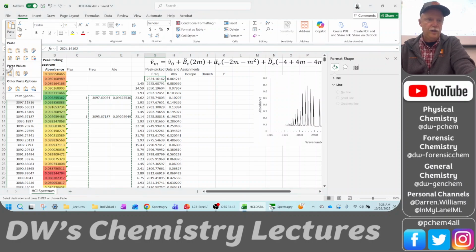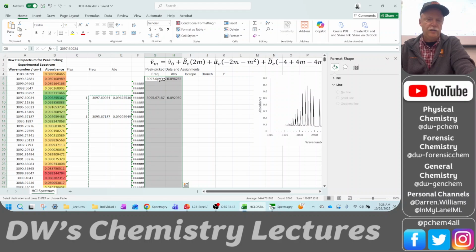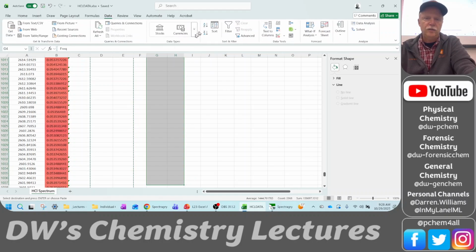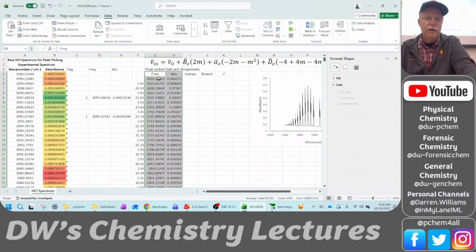Paste values. I don't know how to get it to not paste those little sort of text blanks. I'm sure there's a way to do it. So I'm going to go to data, sort, low to high, and it did it just fine that time. And so now we see our pattern. You see the pattern?